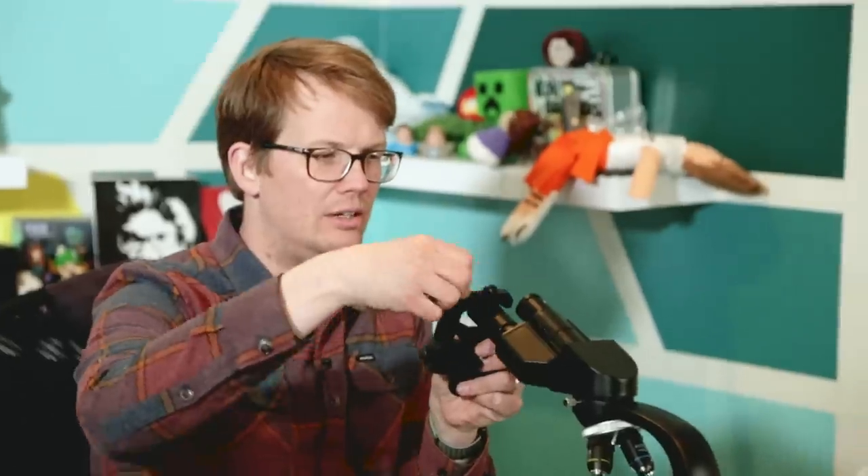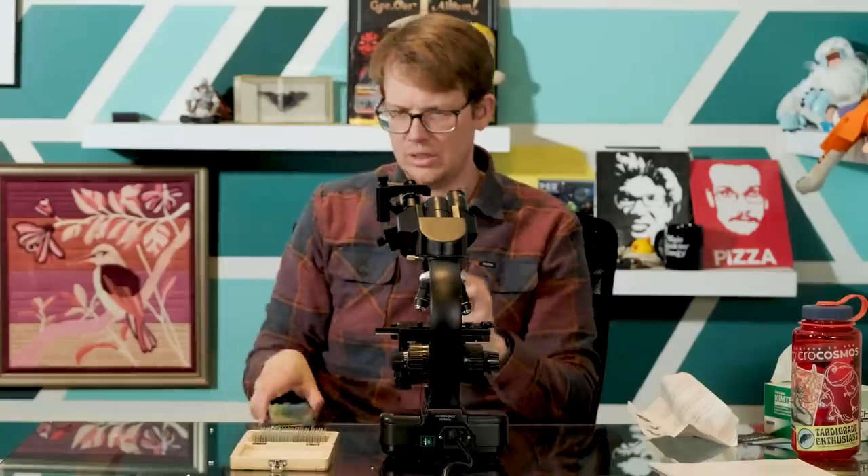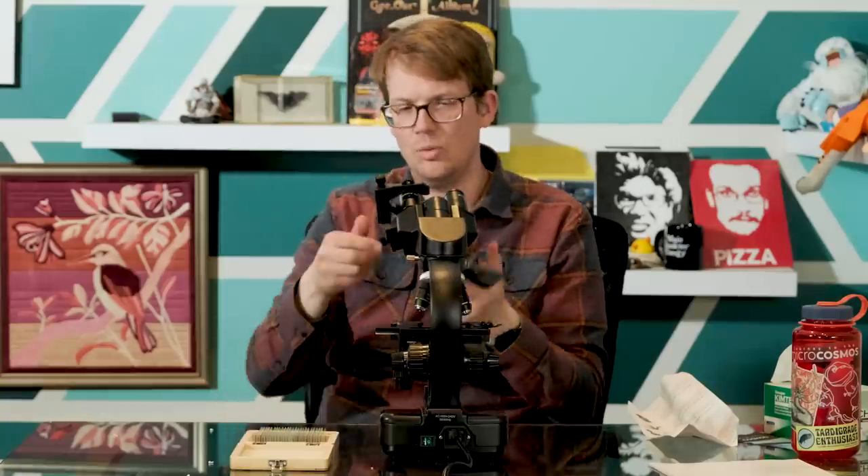So now we're going to use the microscope as intended — I'm going to set up my camera in here. We have our prepared anatomy slides, which are also available at microcosmos.store — and the box is so cool. This clamps on here. We're lining up the mount flush with the eyepiece, basically on the same plane. Then I'm going to get my phone in here, which is going to take a while because I've got a big phone.